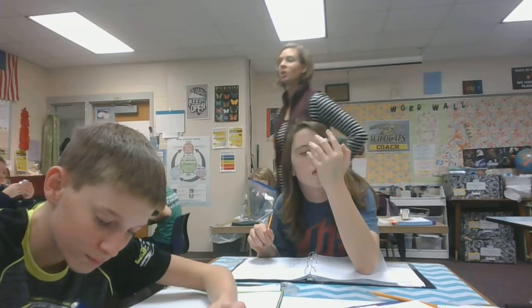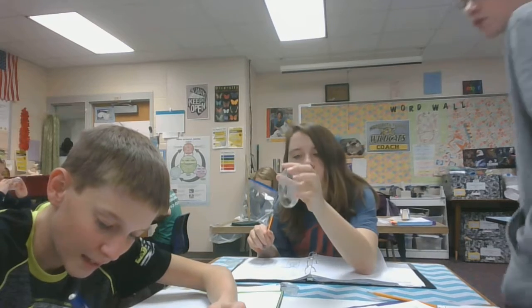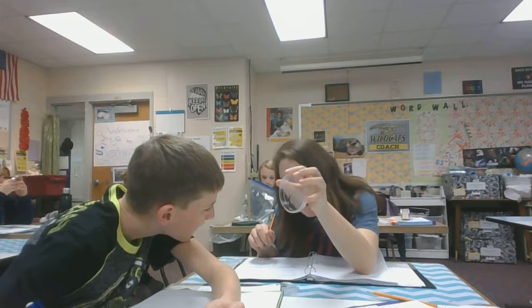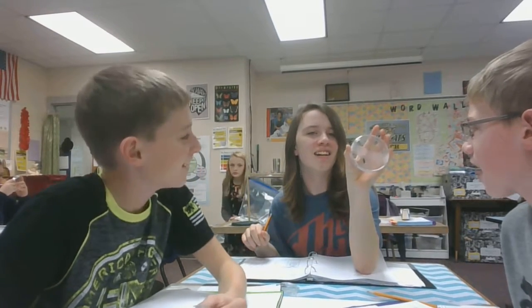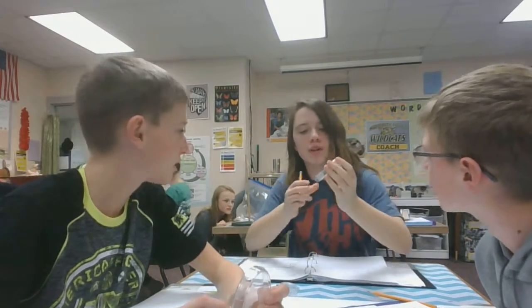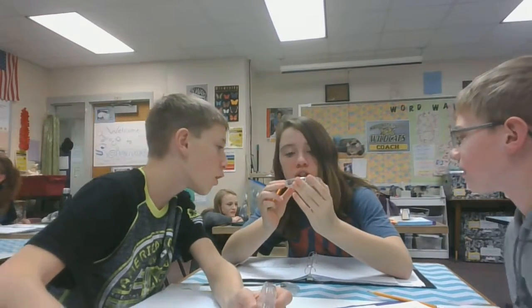Oh, is it? Look, it's underneath the wings. It's rubbing its back legs together. The front legs are sticking to the petri dish, and the back legs are off the ground. There's a second layer of wings.